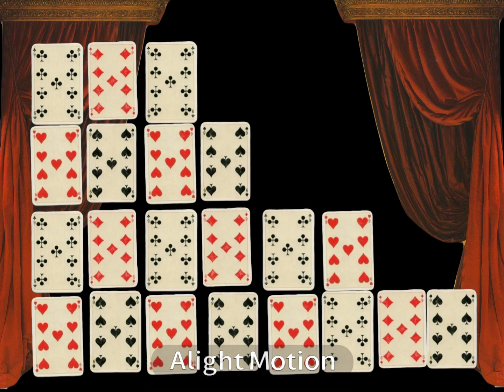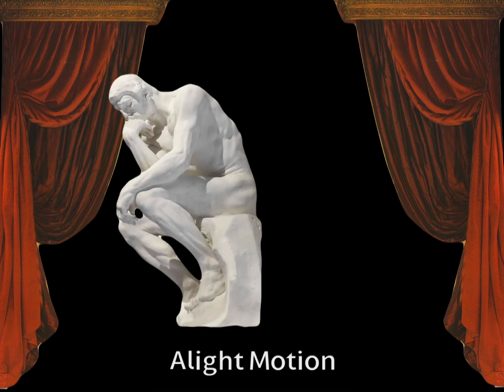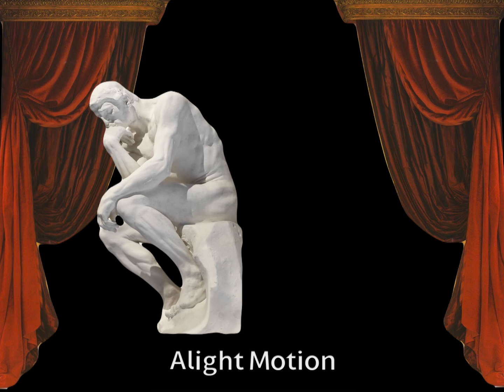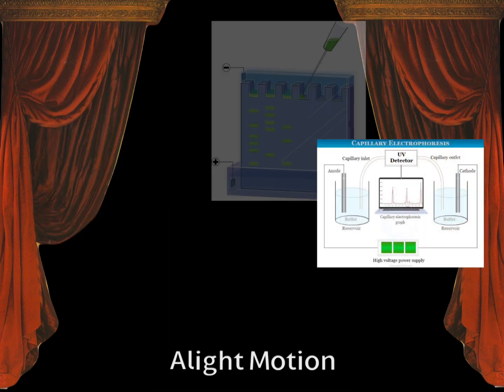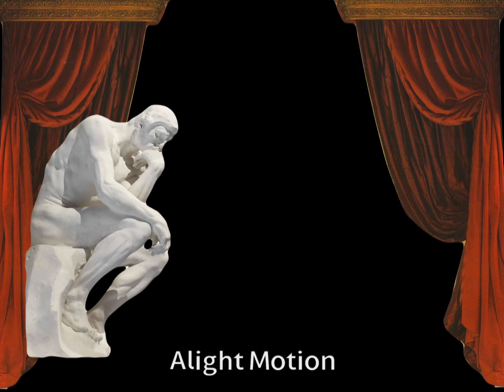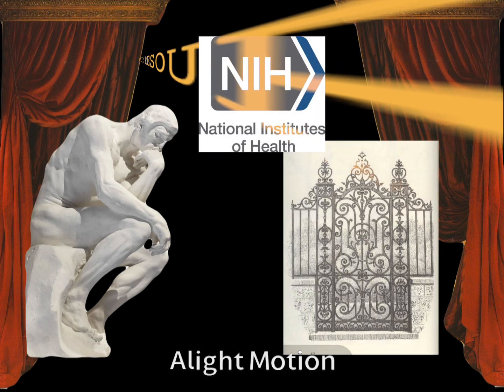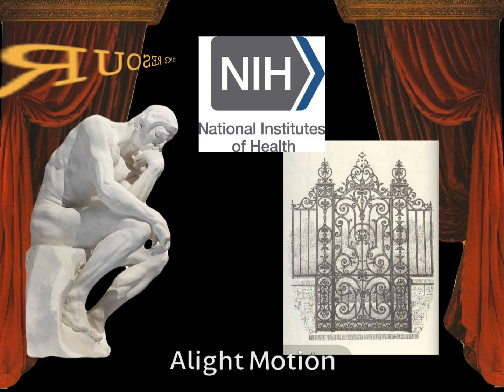We pretty much have finished our ideal metaphor, but of course there are still more things to explain about the Sanger method. My last comment on this makeshift card game would be that the objective of it is to find the most time-effective method of sequencing, hence why it is adjusted over time. Later on, other improvements were made, like the advancement of using capillary electrophoresis or using Taq enzyme instead of polymerase. These improvements can be read more about on websites like ResearchGate or the NIH, the National Institutes of Health websites. Today, we do not have time to cover them.